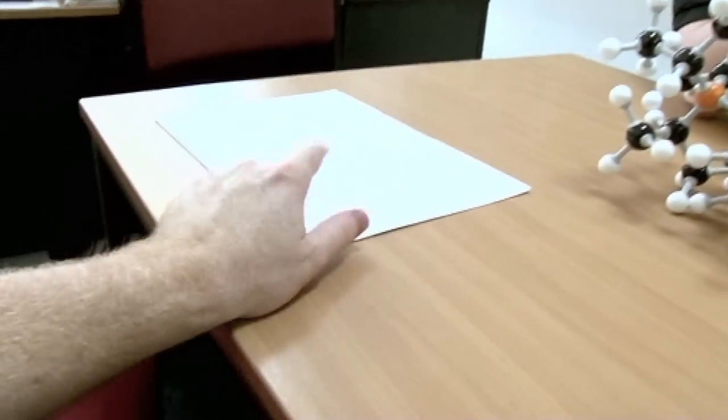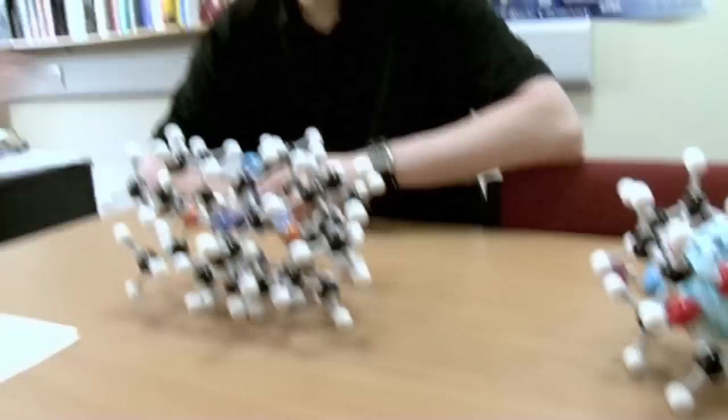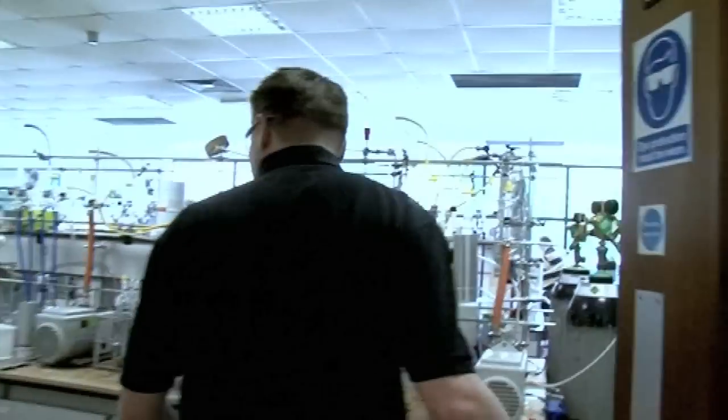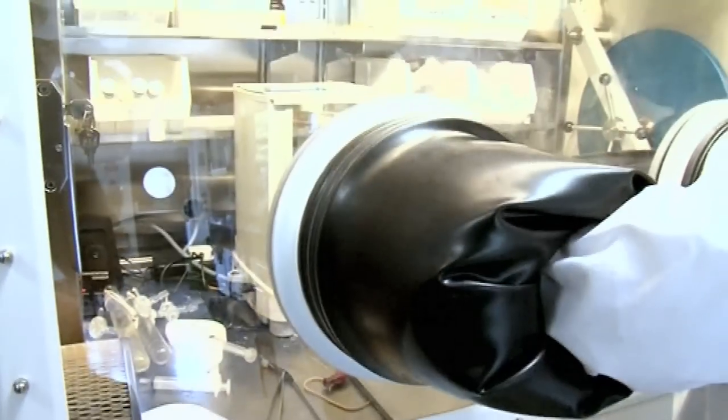So Steve, we've seen the paper. We've seen the moly mods. Can you show me anything real? Absolutely. Come this way. Hello. Okay, so this is one of the labs where some of my group are. This is Dave. He's a PhD student. He's the guy that actually made this uranium nitride molecule.